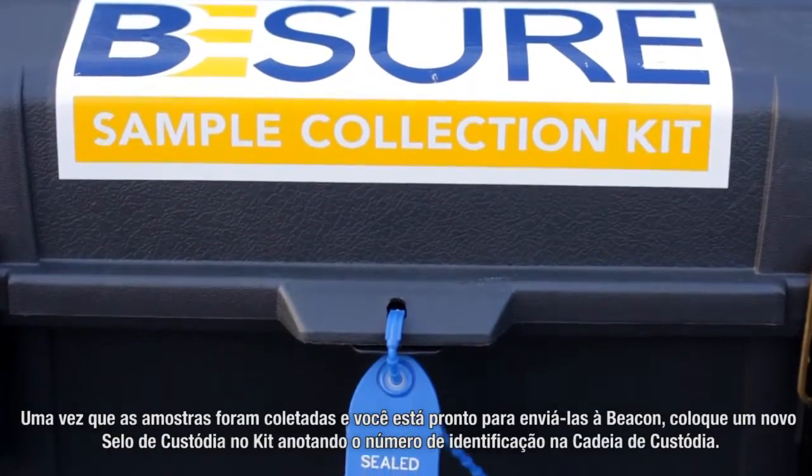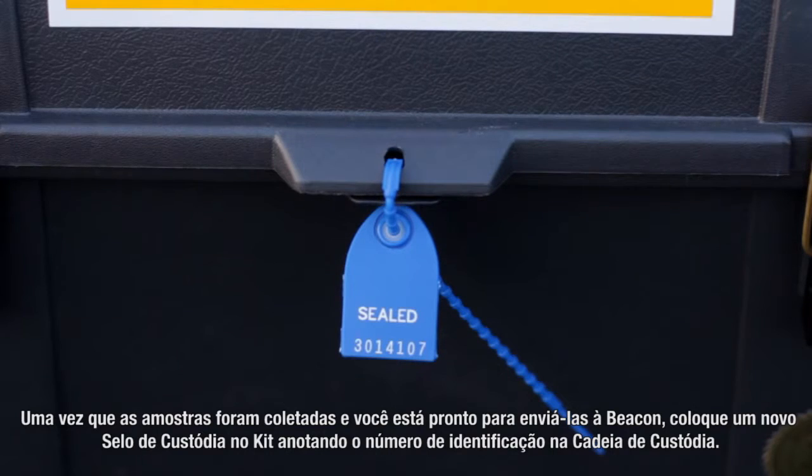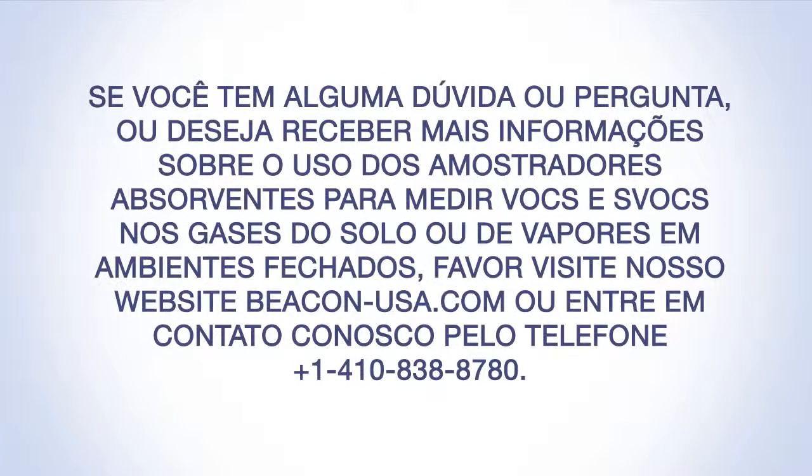After all samples have been retrieved and you're ready to ship the sampler to Beacon, affix a new custody seal on the kit noting the ID on the chain of custody. Review the provided kit return checklist. Place the kit in the original cardboard shipping box, include the completed and signed chain of custody, seal the box, and ship the kit via express delivery to Beacon. No ice or preservatives are required for shipment. If you have any questions or would like more information concerning the use of absorbent samplers to target VOCs and SVOCs in soil gas or indoor air, please visit our website beacon-usa.com or contact us at 410-838-8780.